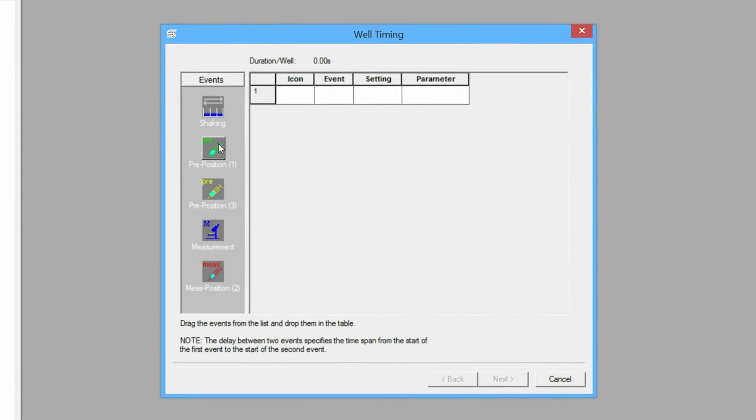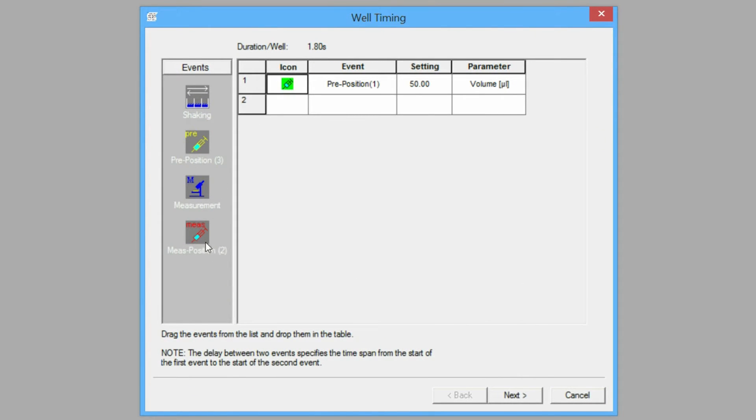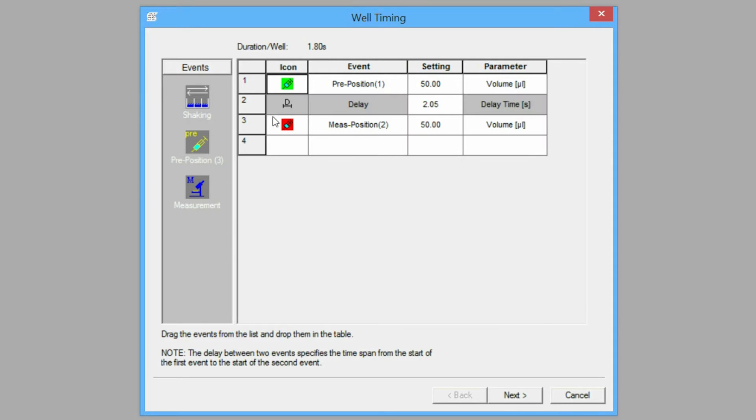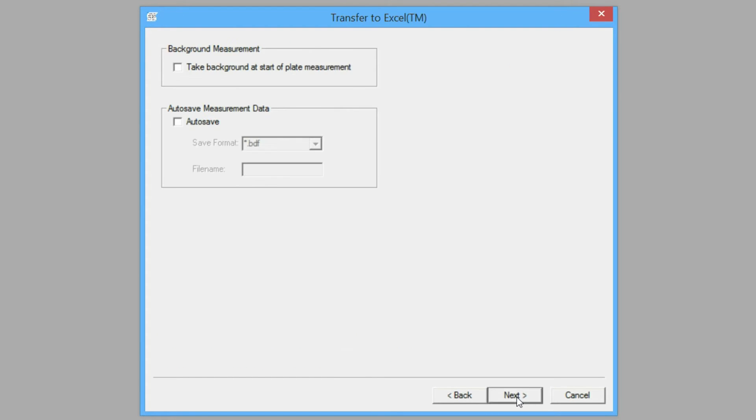Protocol steps can be arranged in any desired order and are easily configured. Measurement time can be selected up to 100 seconds by row or column, and samples can be read multiple times up to hours or days. Results can be automatically sent to Excel for further calculation.